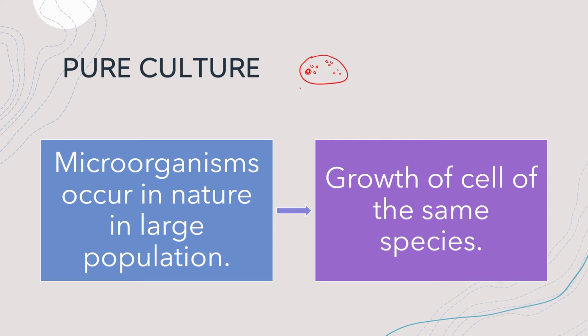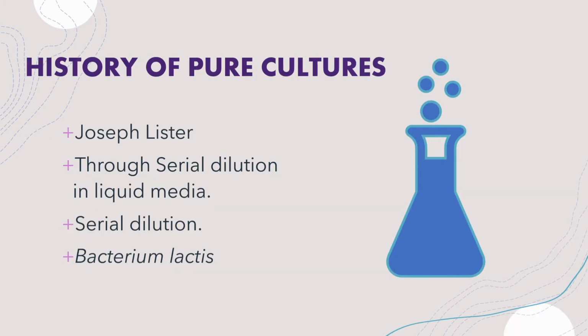The growth of a mass of cells of the same species in a laboratory vessel, a test tube, or any other equipment or instrument is called a pure culture. Now, the history of pure culture.